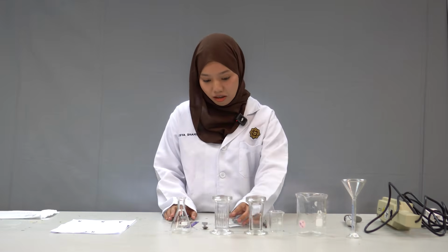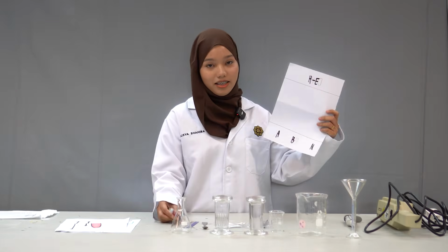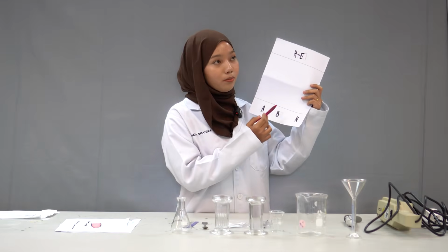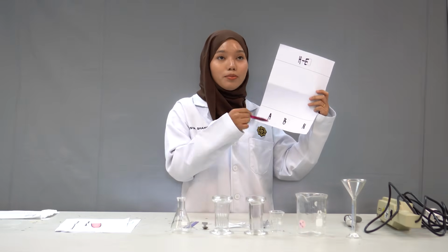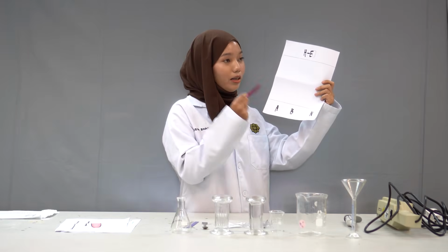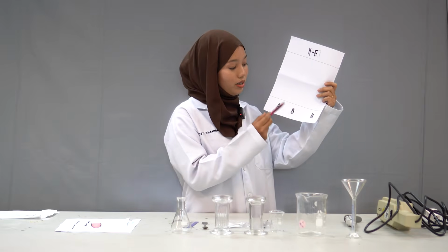So let's continue with the procedure of the experiment. First, we need to prepare the TLC plate. Assume this is our TLC plate. Using a pencil, draw a horizontal line about 1 centimeter from the bottom of the plate. Along the baseline, label the spot for each sample solution: A for acid, B for base, and N for neutral.